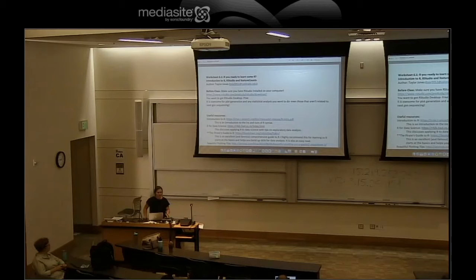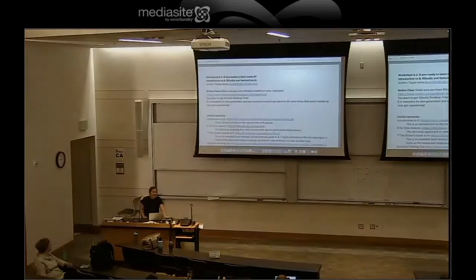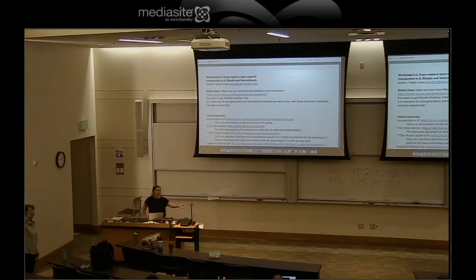I think it's worth spending a good amount of time on R because, like Mary said, it's going to make some beautiful plots. You get all the way through your data analysis, you're going to the publication phase with these big old tables. How do you make a plot out of them? How do you get a publication-worthy figure? That's part of it, and the other part is you get these big old tables, they're 20,000 some rows long. Do you really want to open them up in Excel and try to fight with Excel to get the information you want out of them? The answer is no, and R is awesome for that.